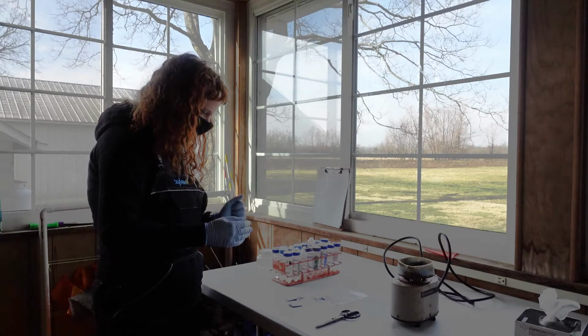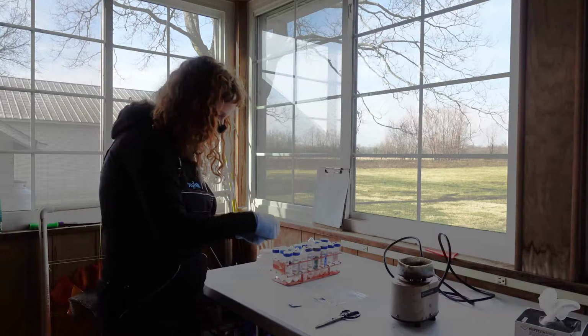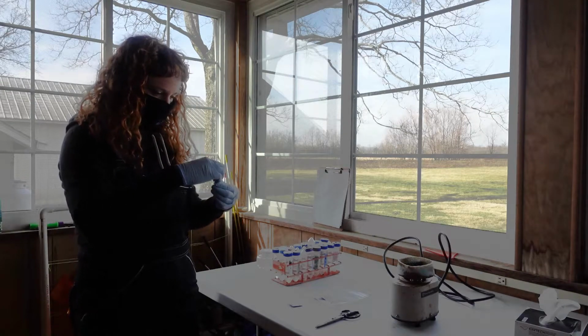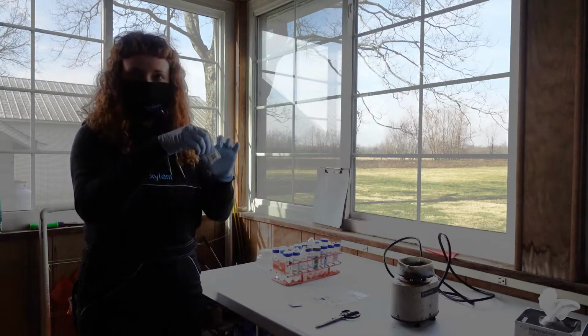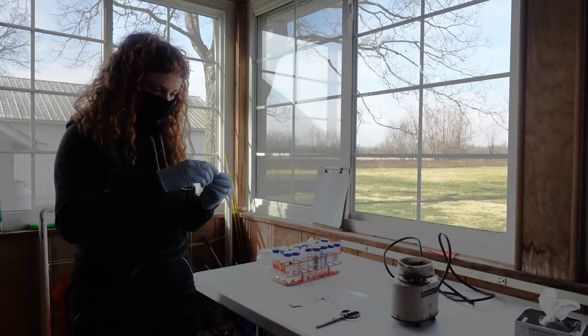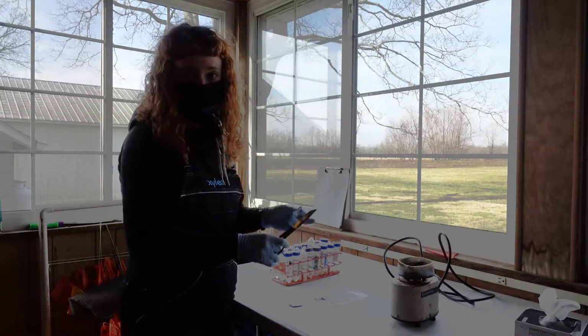So what we will usually do is we'll take a couple of these small pouches at the same time. So here I have 3. And I'll hold them at the top and I'll brush them or flick them. Sometimes we need to get the reagent down into the bottom of the pouch. So just a couple seconds. And then we will cut these open at the tear mark.